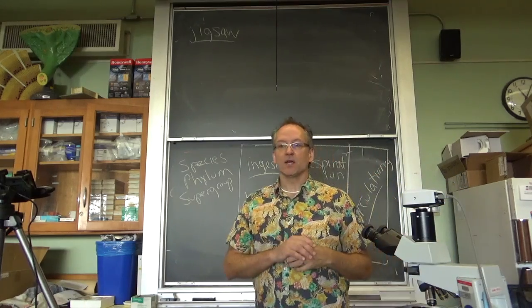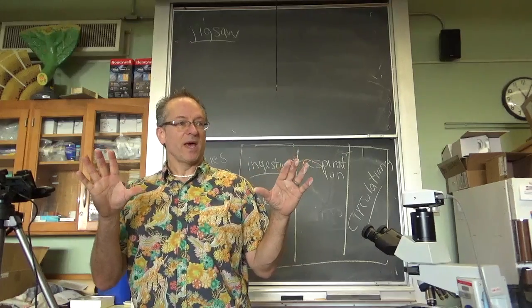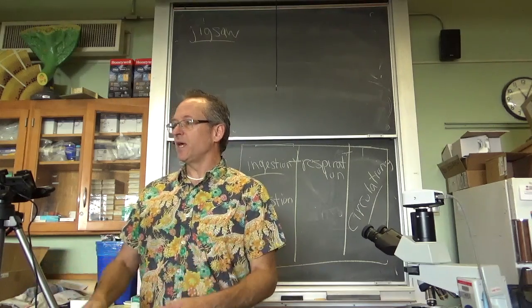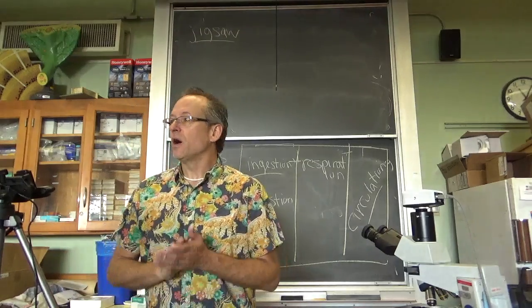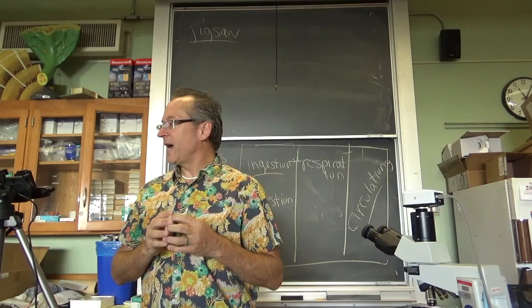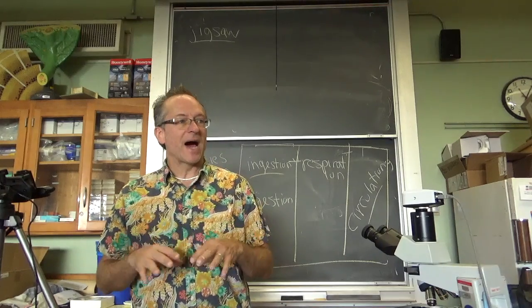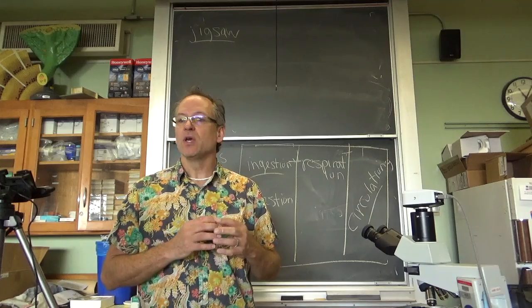You'll be making sketches, and like I said, I want them to be as big as possible in your notebooks. Your notebooks will sit up here underneath a camera, and you can say, look, the fish has teeth, and they look like this. That's going to be your goal for this lab, and we should be able to do most of the dissections in about an hour or so, and then leave some time for presentations.